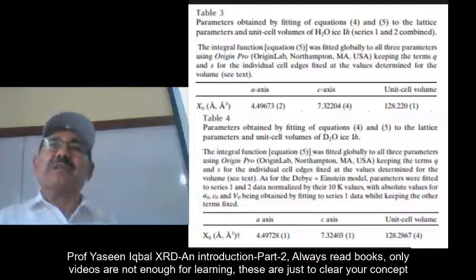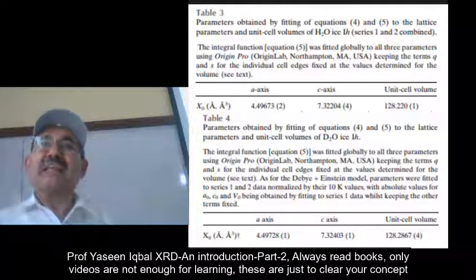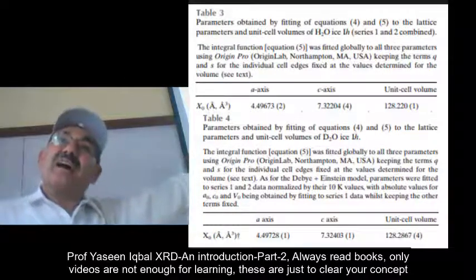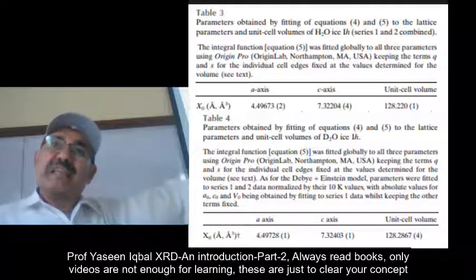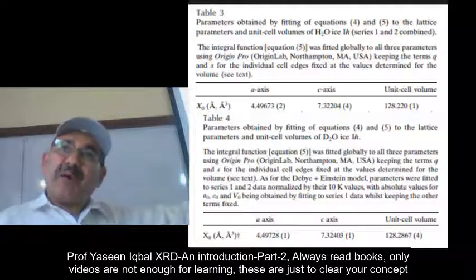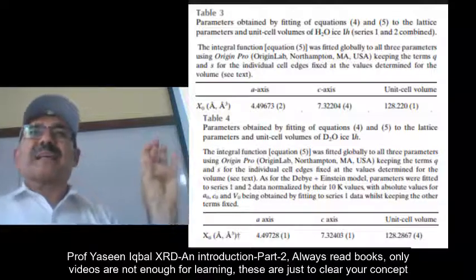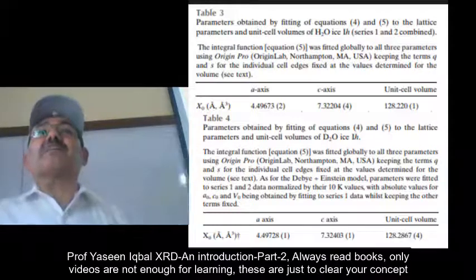Can a person do his PhD in 2 days? Never, because he is not supposed to do things as they are. He is struggling to do the things in his way or her way. But if they get the diffraction pattern of H2O, crystalline H2O, they have to check all the other possibilities.